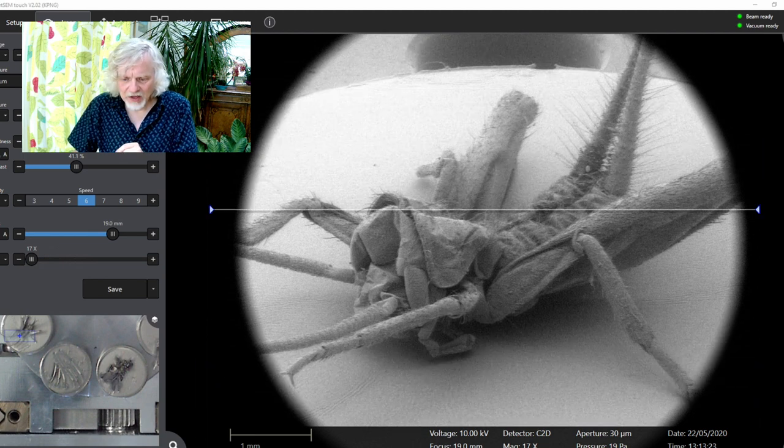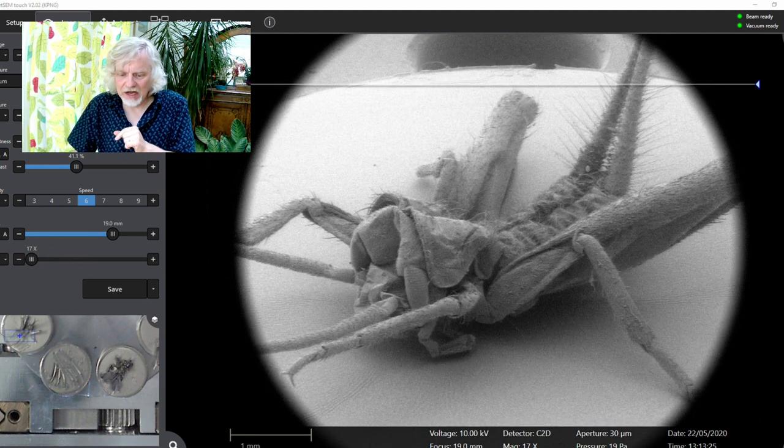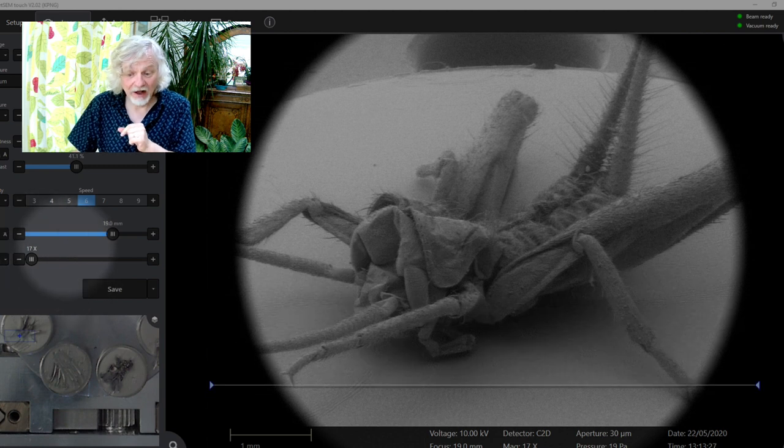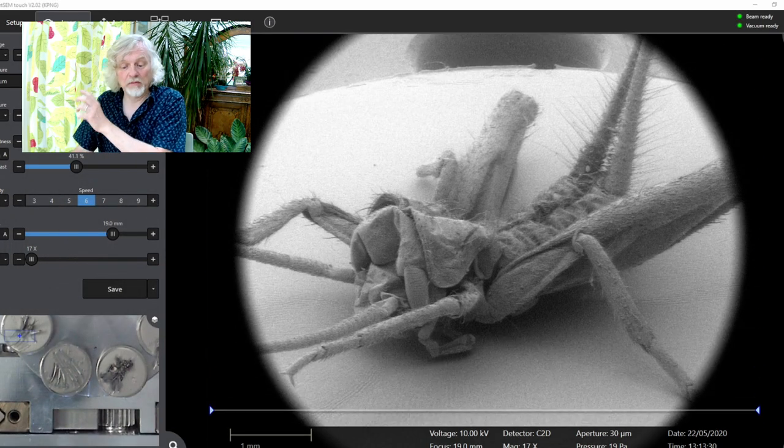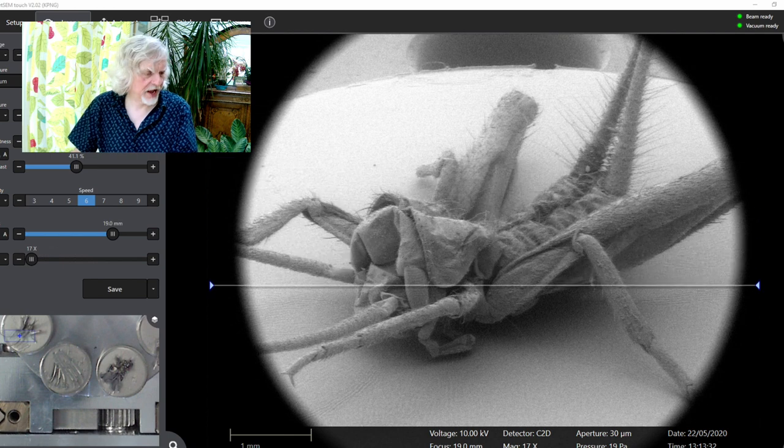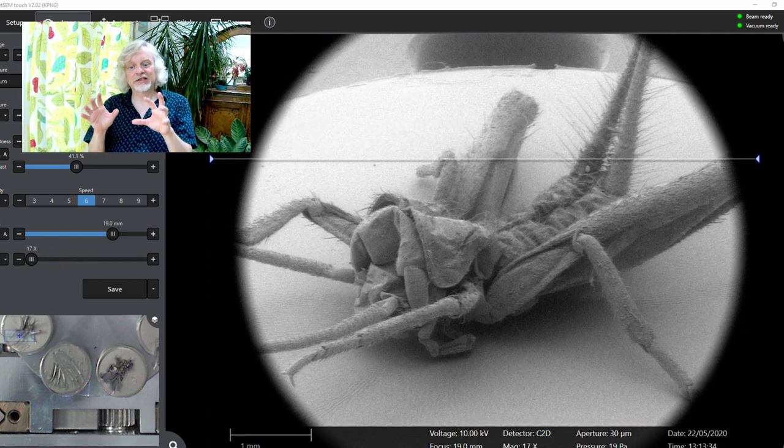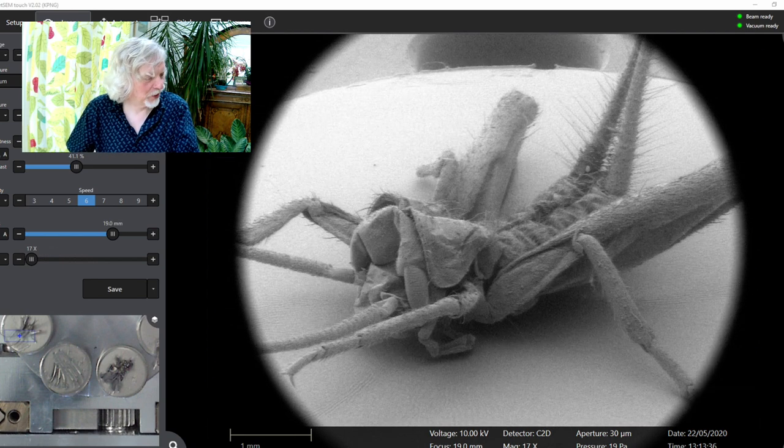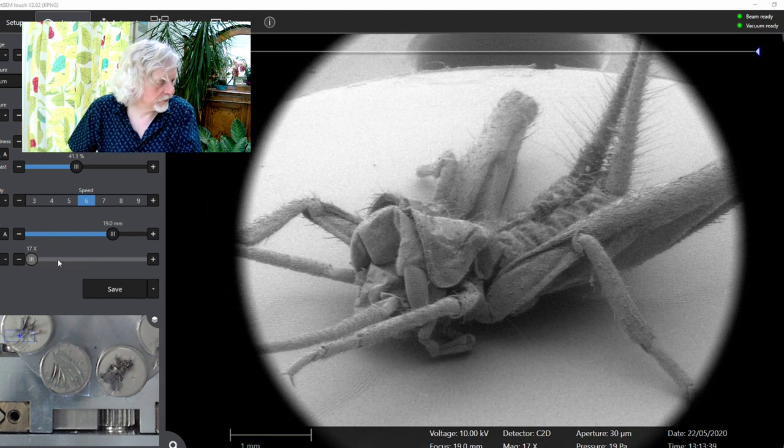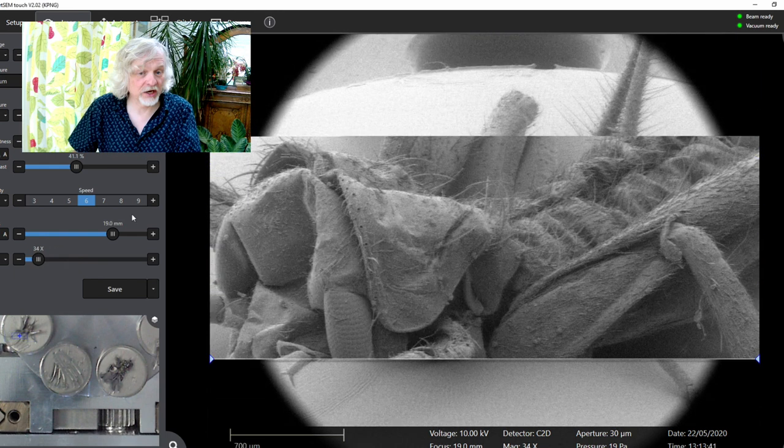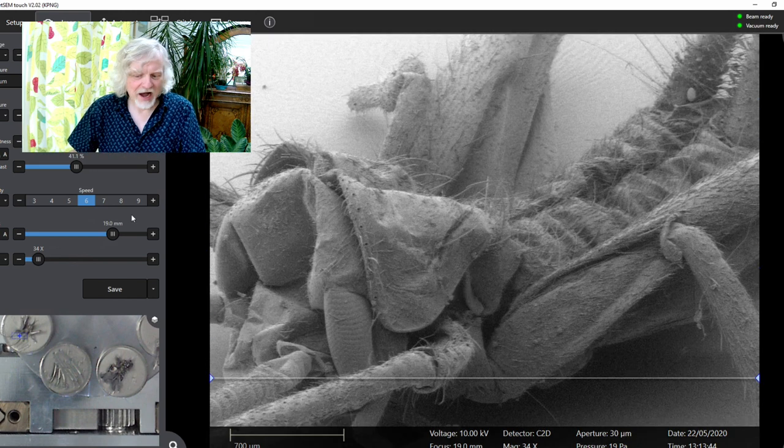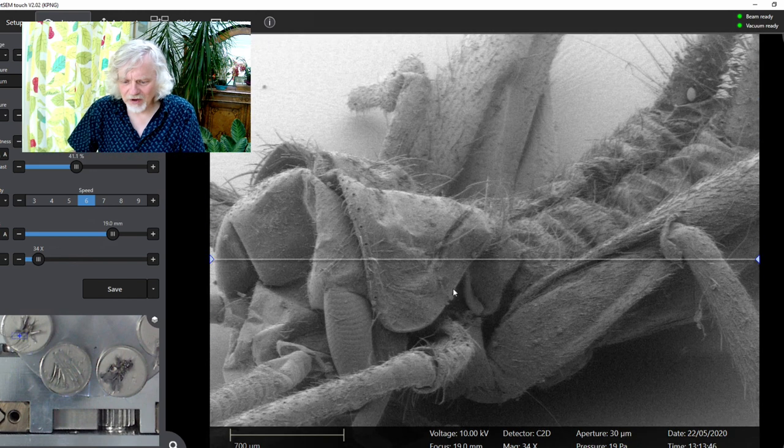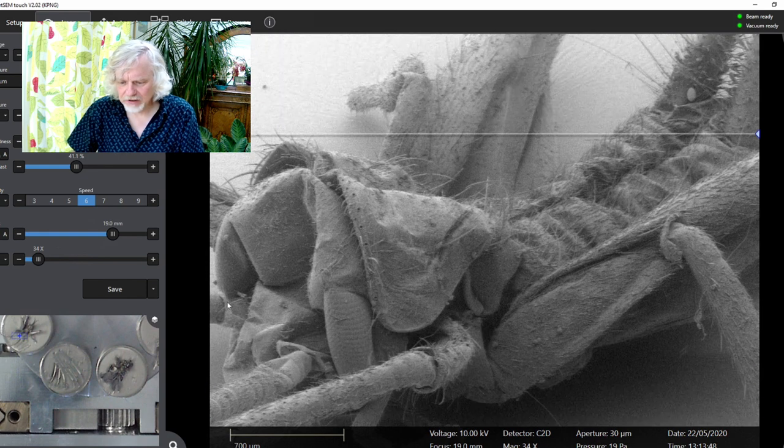So to zoom in, all I have to do is click over here, and that zooms in a little bit. We might have to focus as well, but we'll see how that works. Ken is behind the scenes tweaking the image as we go along. So I'll zoom in a little bit here, and immediately we kind of boom, we zoom in a little bit. And I want to maneuver myself around a little bit.